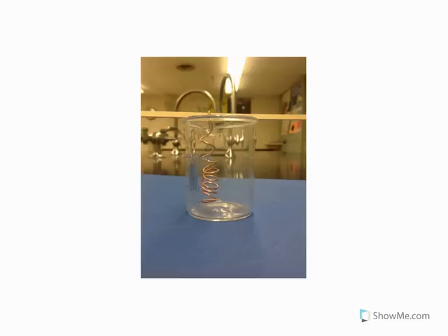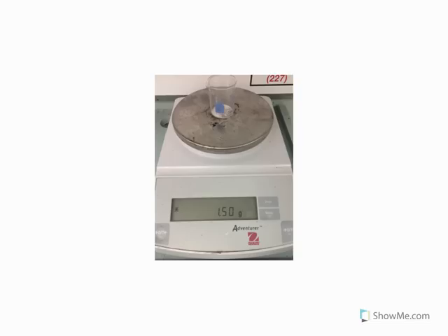Use a wooden splint to suspend the copper wire into a 50 milliliter beaker as shown here. You want to stretch the wire down so that the wire is completely towards the bottom but not touching the bottom of the beaker, similar to the ornaments that were made with the borax at Christmas time. Remove the copper wire from the beaker and then bring your beaker up to your teacher.